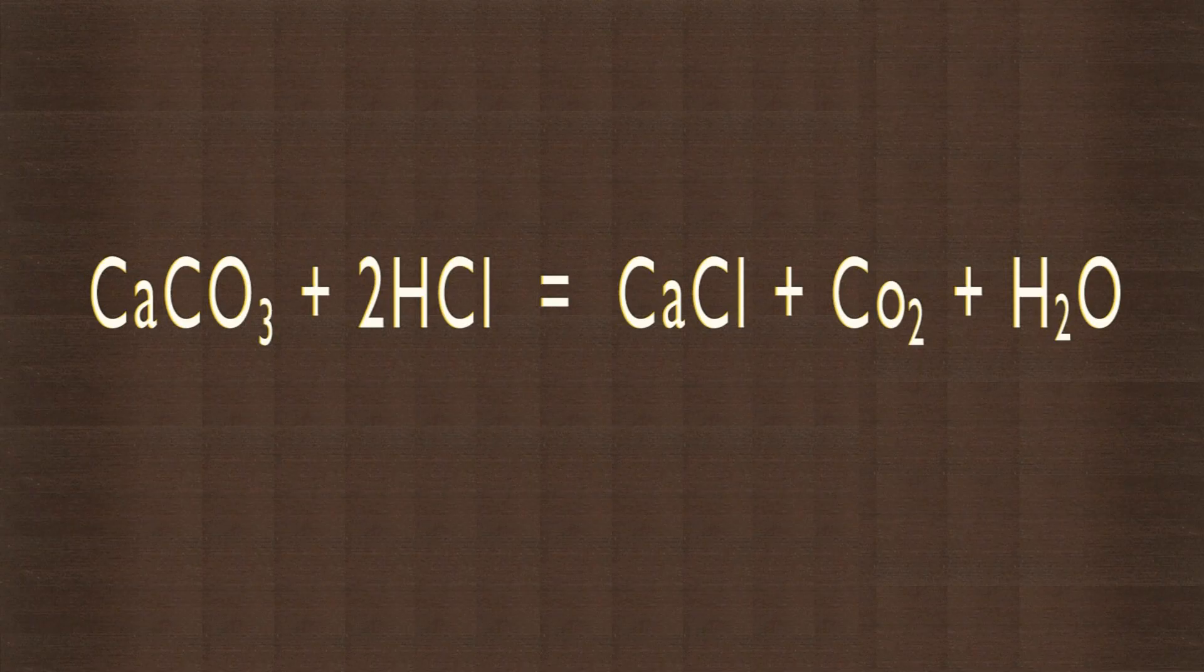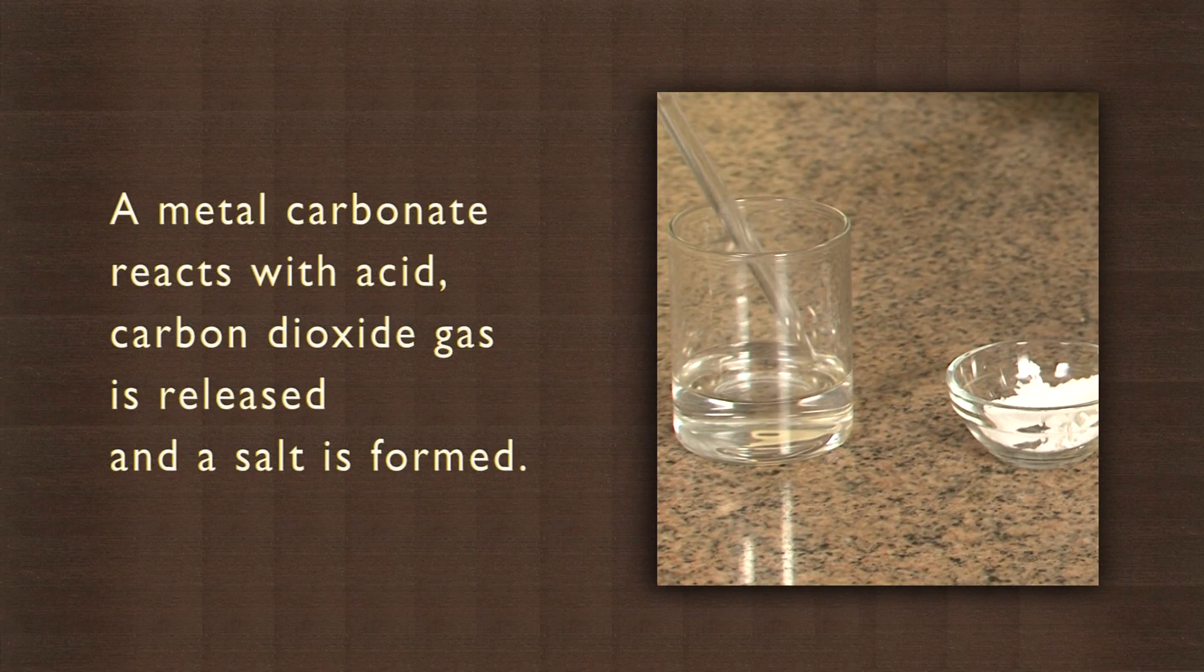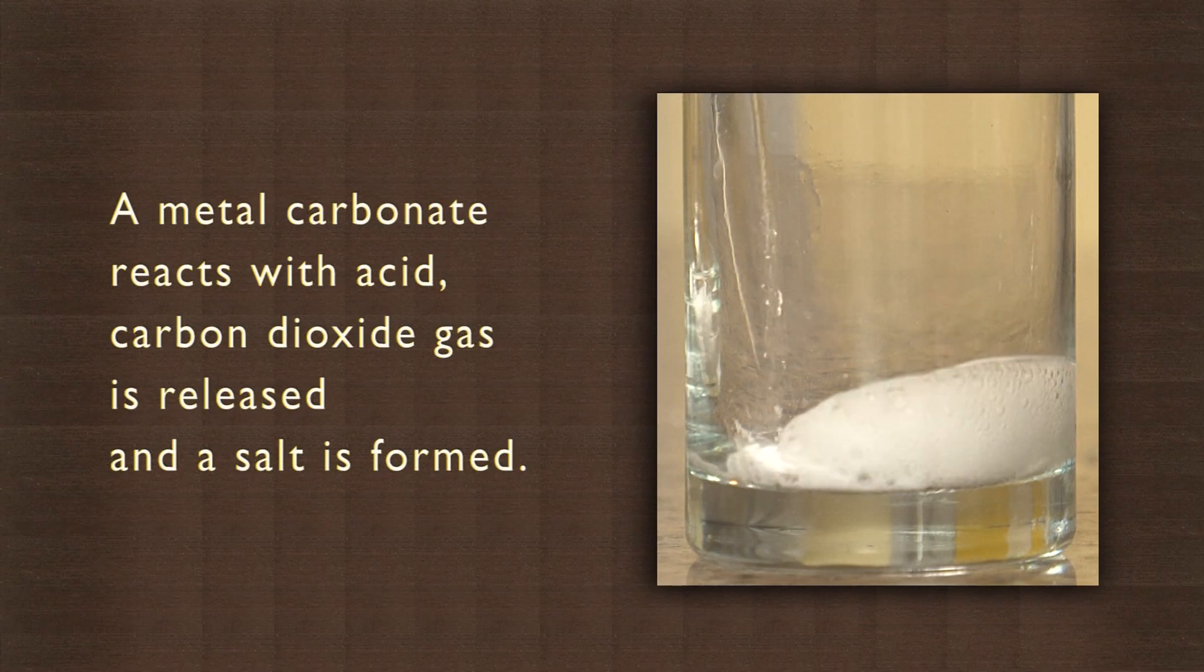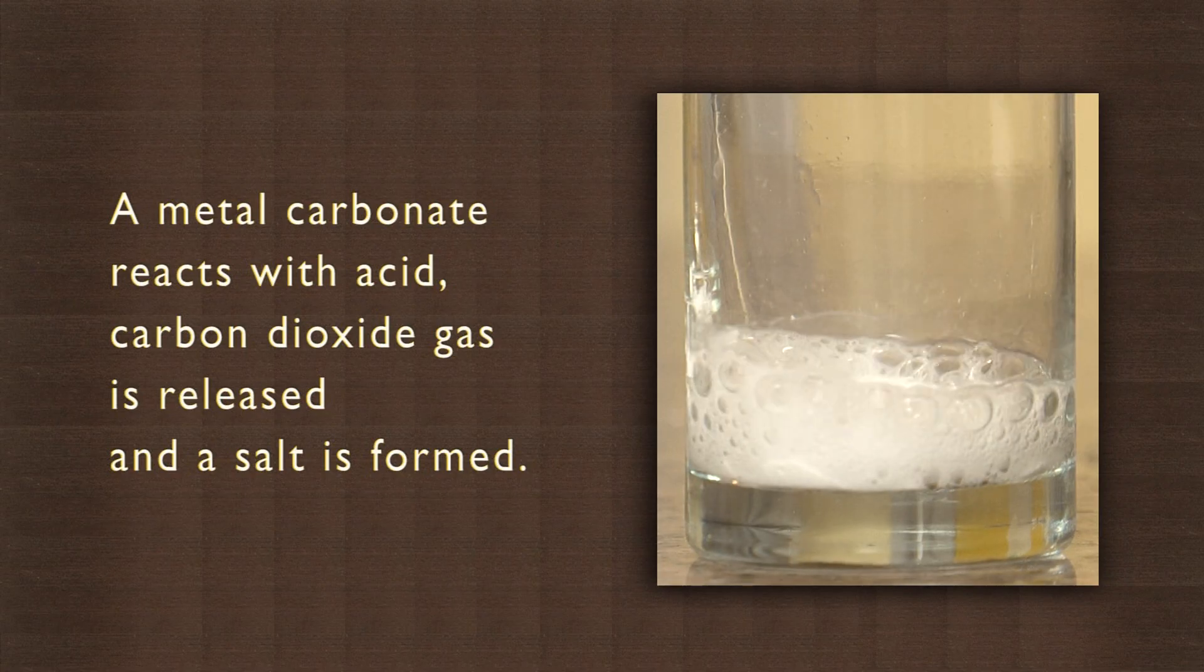A metal carbonate reacts with acid, carbon dioxide gas is released, and a salt is formed. You can try similar experiments with other carbonates and acids.